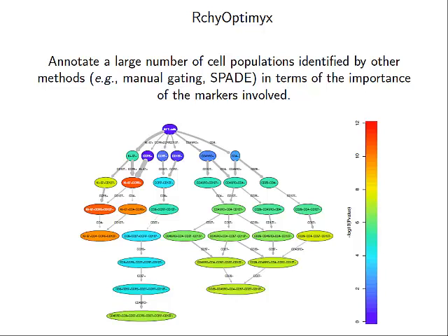In order to do discovery, your hypothesis is that I have a bunch of samples in group one, a bunch of samples in group two. So what's the n in each one? I would be a rich man if I had a dollar for every time I got that question: so how many, what's the power? It depends.